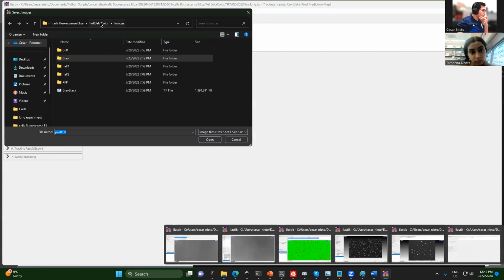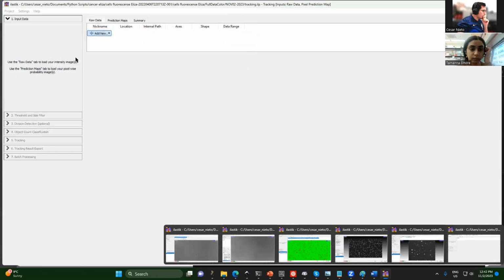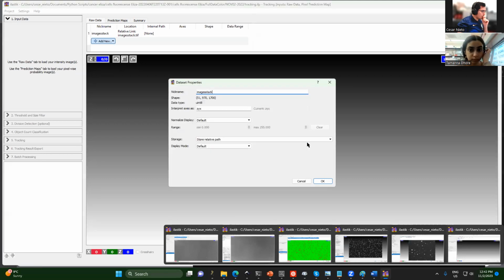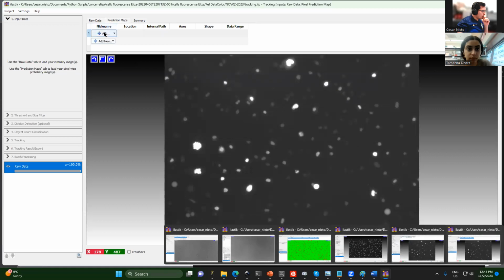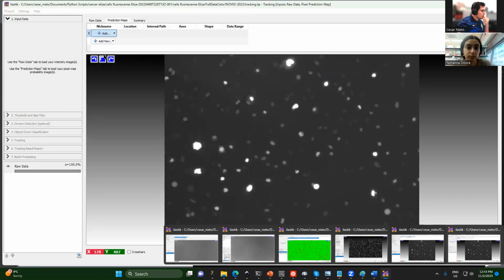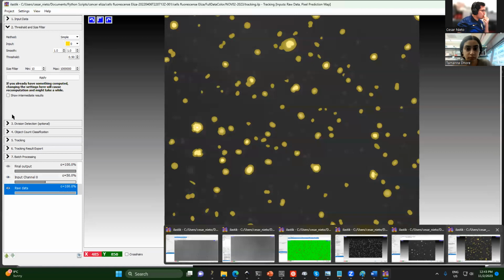Raw data. Let's try the GFP images. For this guy's time, XY. For prediction, this guy. Okay. Looks promising.